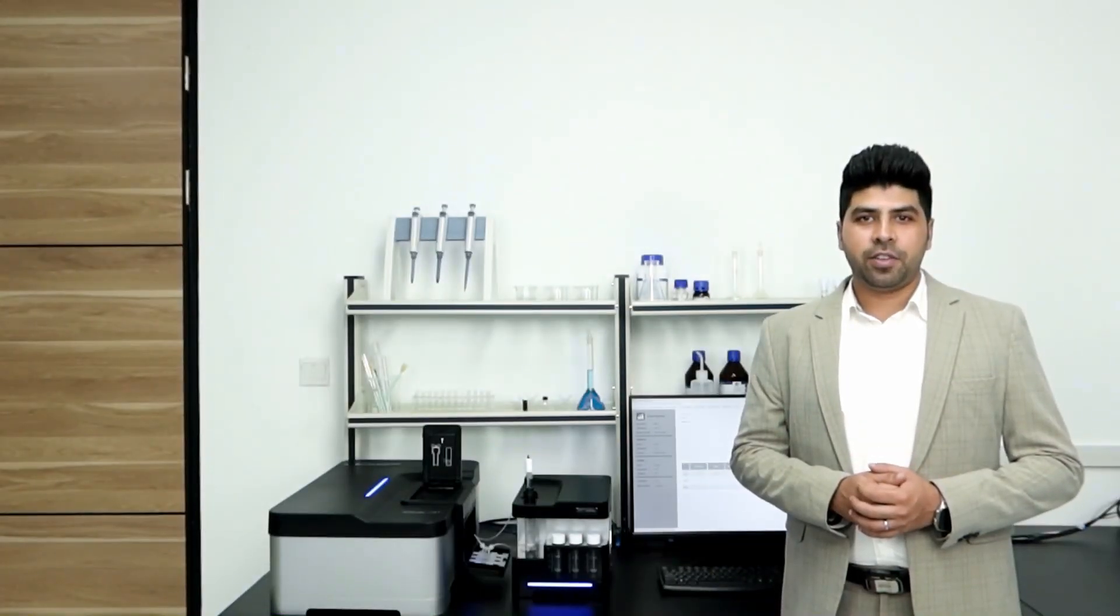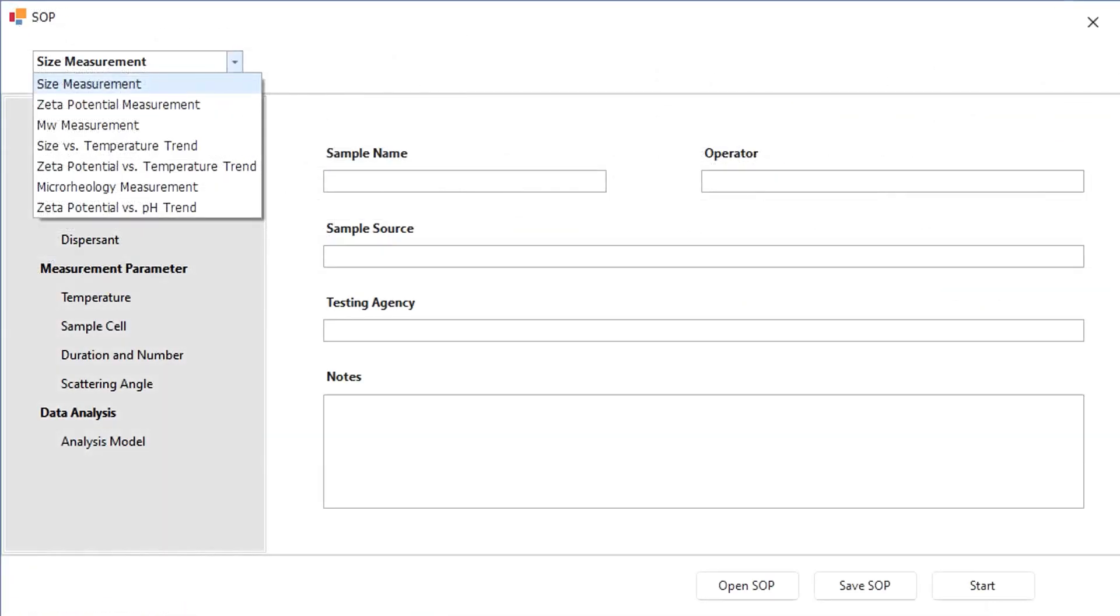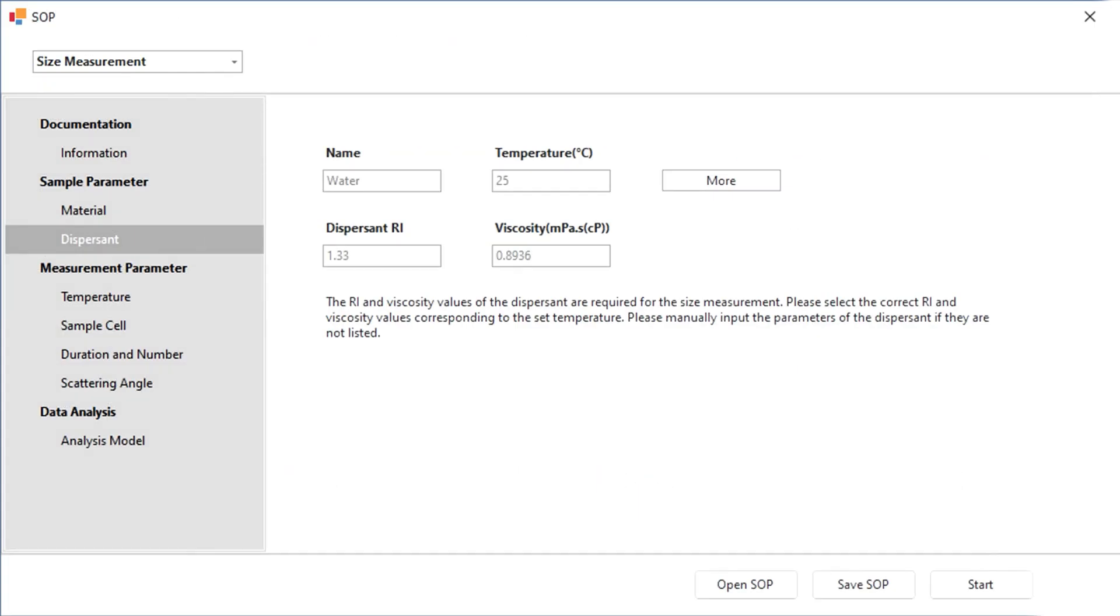In addition, it comes with research-level software that offers a user-friendly interface, various prototypes, and a SOP for conducting independent measurements.